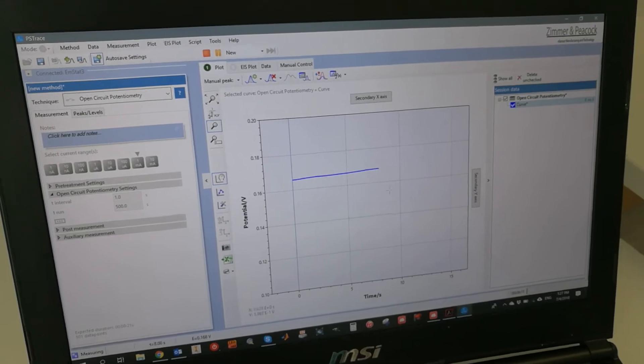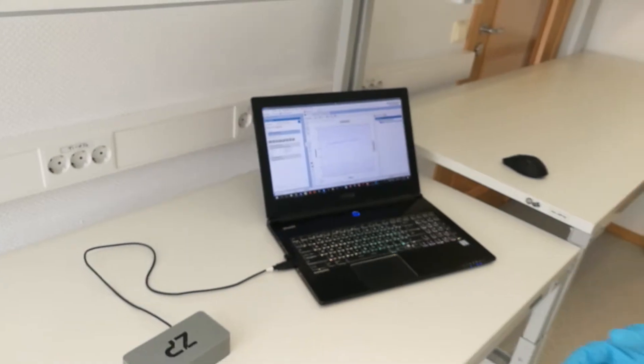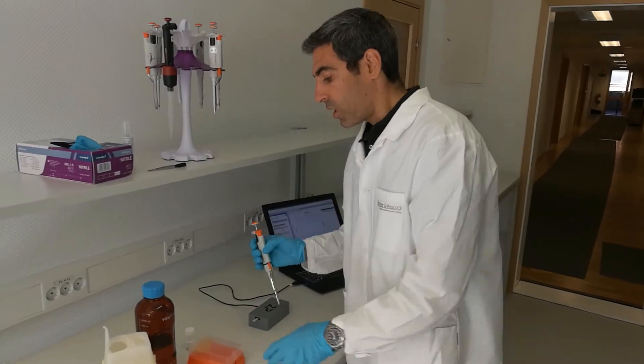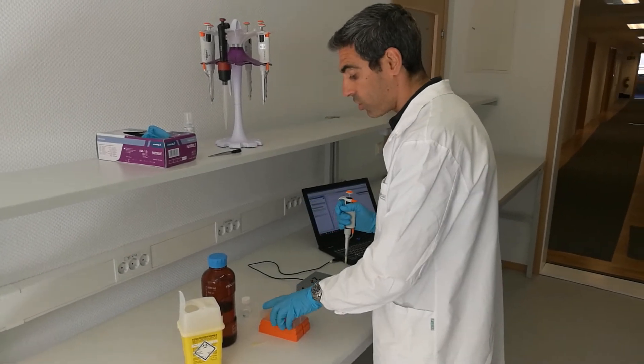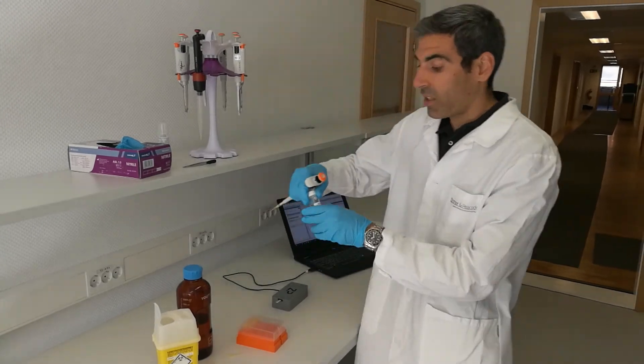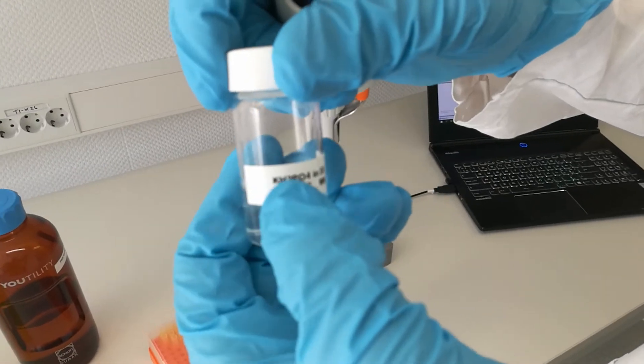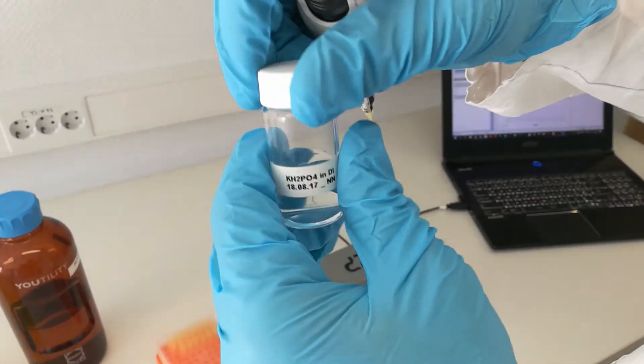What I'm going to do now - since we don't want to add chloride, because this sensor is basically based on the principle of the Nernst equation, and a change in the chloride concentration will actually change our potential - we're going to add a solution that is chloride-free. In this case, potassium dehydrogen phosphate in water, one molar solution.